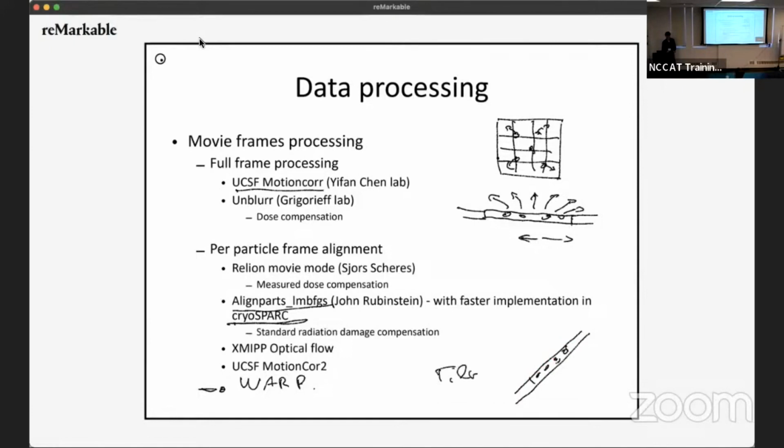With the doming that we had, in the initial case you were seeing a fairly small movement in XY for something that might be much larger in the Z direction.